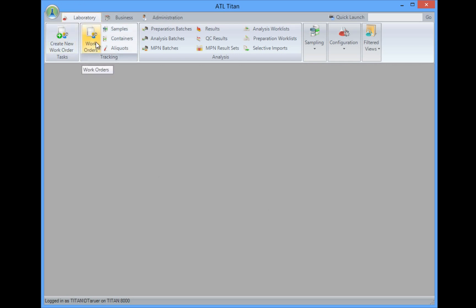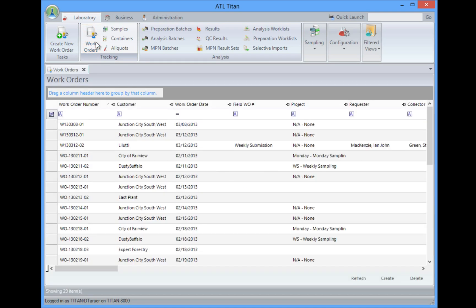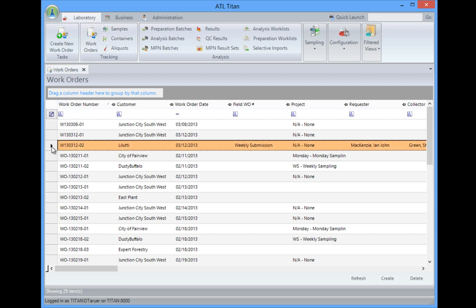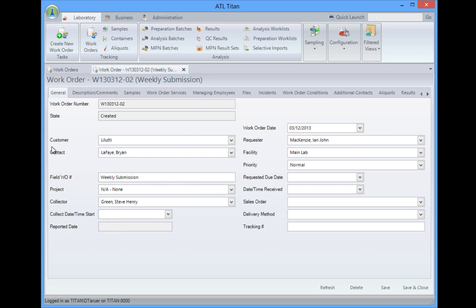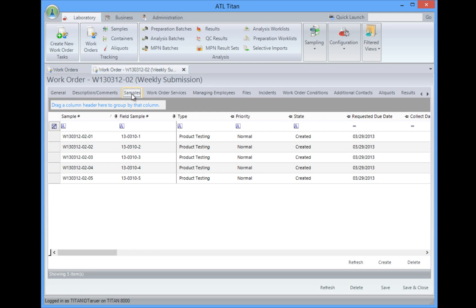I'm going to start out in the laboratory area, and we're going to take a look at a work order. In Titan, we use work orders to indicate projects or sampling events that have been submitted to the laboratory to be analyzed. A work order can contain one or more samples, and each sample can contain multiple containers, and we can even assign the appropriate analysis methods to be analyzed down to the container level. Just a little bit of information here, general information on the work order. We can also come in here and right at the work order level see all the samples that were submitted at the time.